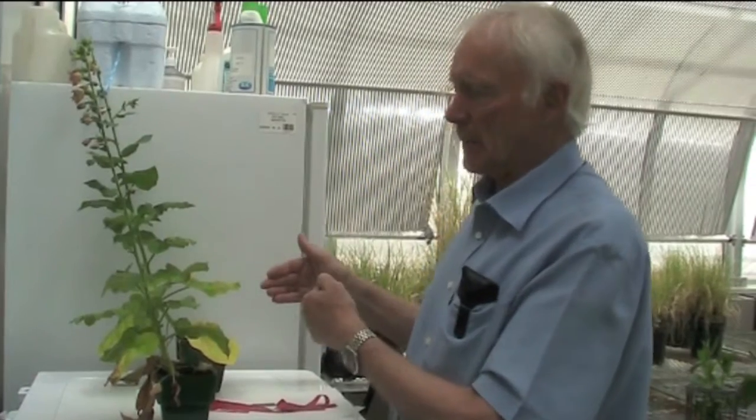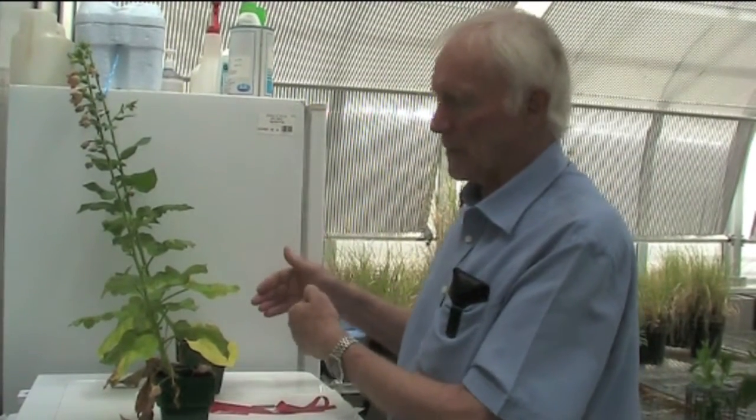When a virus is not mechanically transmissible, we can still demonstrate that it's transmitted. We can transmit the disease symptoms using a method called Patch Bark Grafting. Grafting is a method where we take a piece of tissue from an infected plant and apply it to a susceptible plant of the same species. The cambium of the infected tissue matches up with the cambium of the recipient plant, and the virus can then translocate across into the recipient plant and infect from that grafting site.